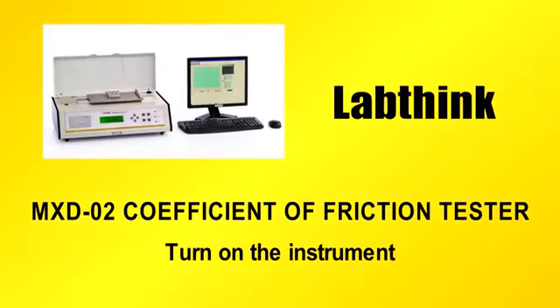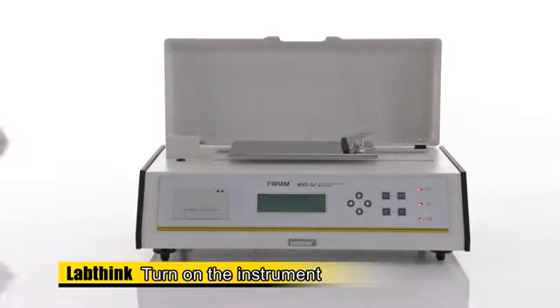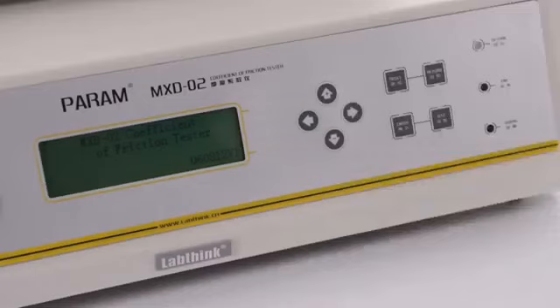Turn on the instrument. Switch on the instrument and the welcome screen displays. Press any key to enter the main interface.